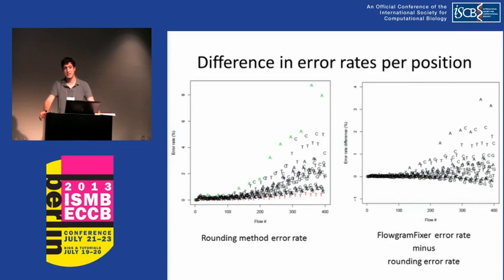So basically what happens is you have the very good part of the read and the very bad part of the read, and in the middle, this is the place where we improve the most. So you would get reads which are longer, but they would be longer by 3 to 7 nucleotides after alignment. So the reads from your code are shorter, right? No, a bit longer. Even longer? And it looks like your hypothesis was that you would get shorter reads. You get longer reads or shorter reads compared to the original one.